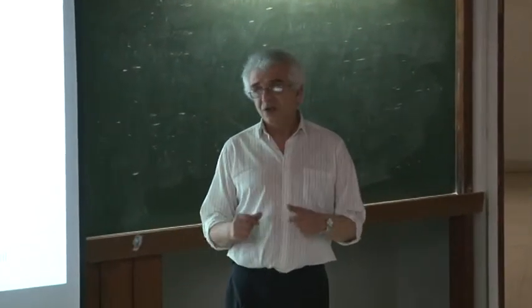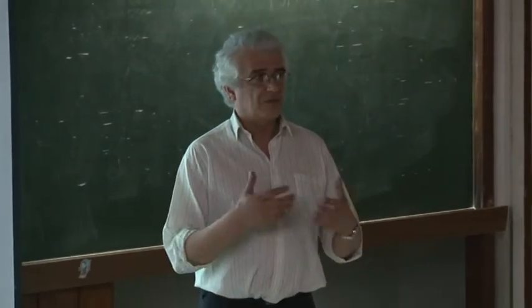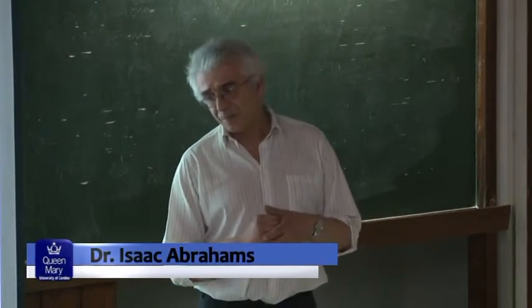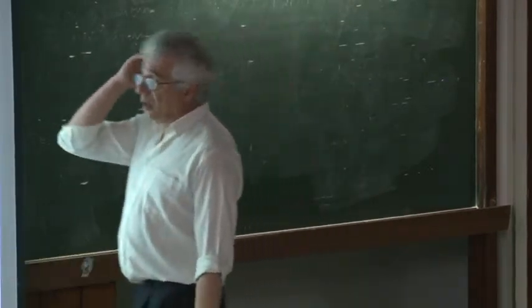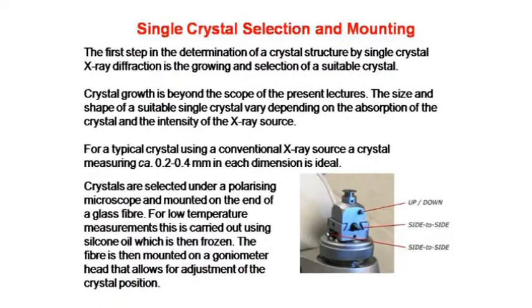So what I'll try to do today is tell you a little bit about that, how you can interpret some of the things, what they mean, and how you can calculate certain things like bond angles, bond lengths. And all these things are immediately transferable to powder diffraction. So, single crystal diffraction.